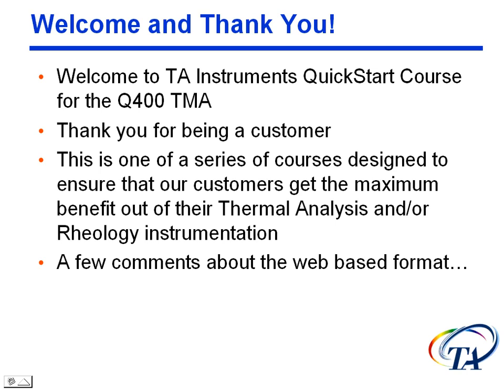The fact that you're taking this class means that you or someone at your company has purchased equipment from us, and we appreciate that. We've designed these courses to help you, our customers, get the most out of your equipment. So we've designed this course as a real basic getting started course. We'll show screenshots of the software, and we'll show you calibration. We'll talk a little bit about the data. So this is what we're going to do in this class.